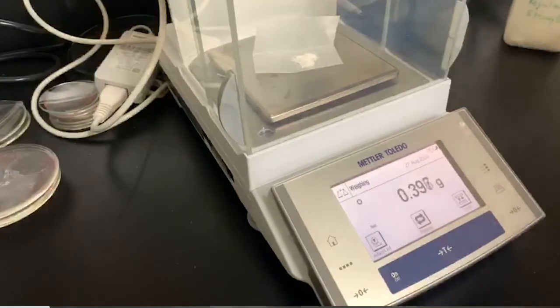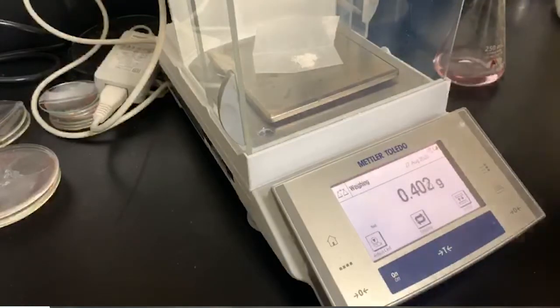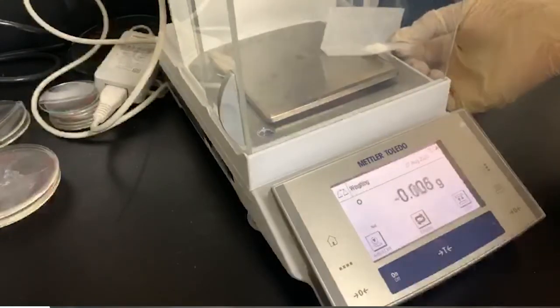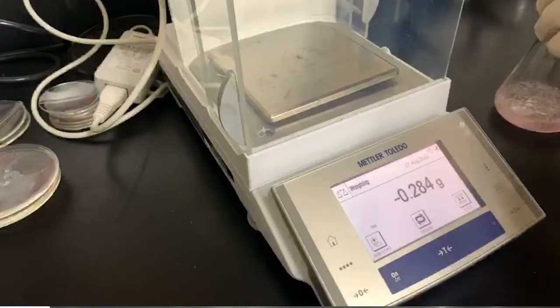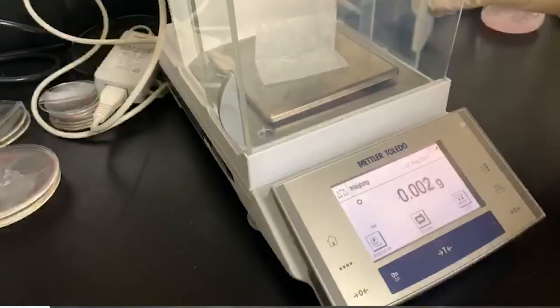All right, so record your mass for that one. And we're going to put that into the Erlenmeyer marked A. And then prep our second sample.